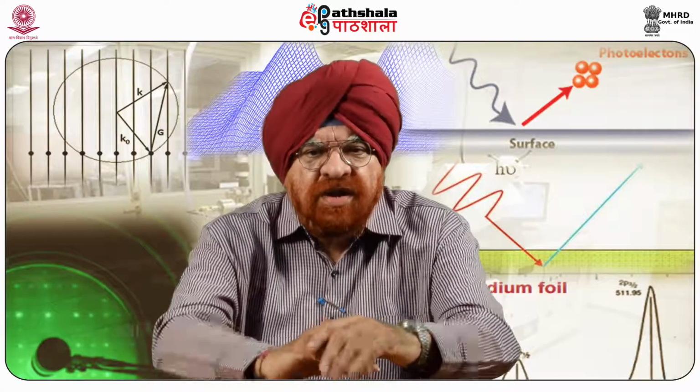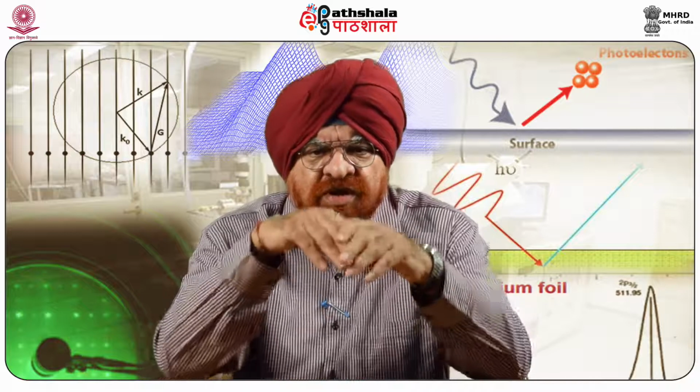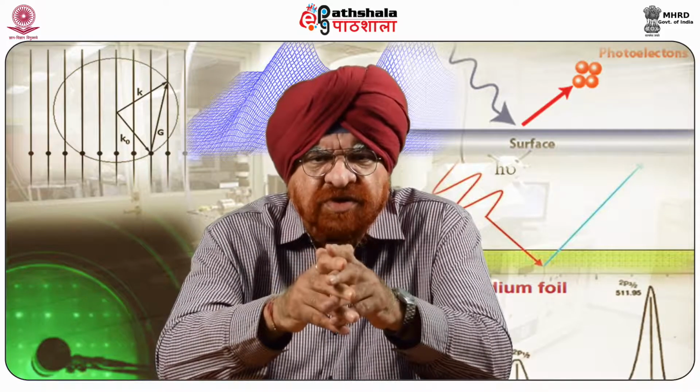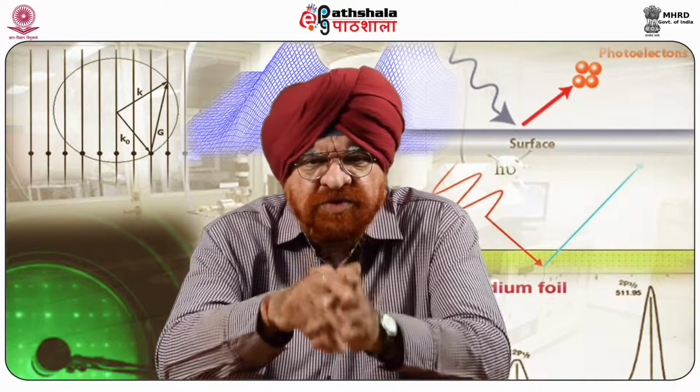Technical capabilities. AFM images show critical information about surface features with unprecedented clarity. The AFM can examine any rigid surface, either in air or with the specimen immersed in a liquid also.